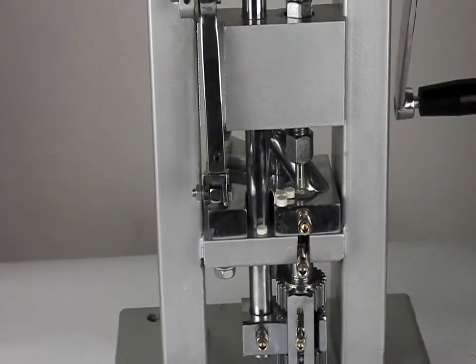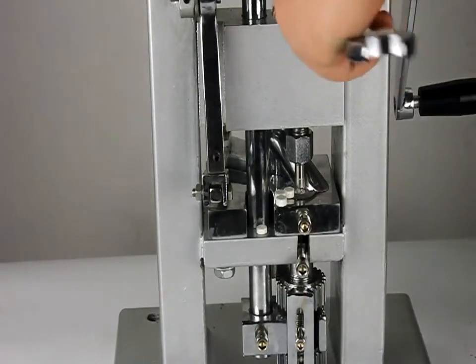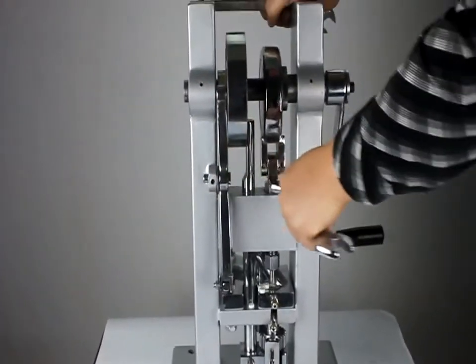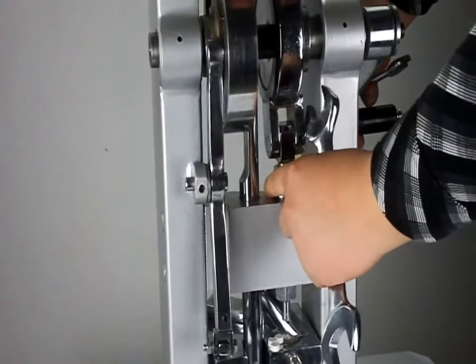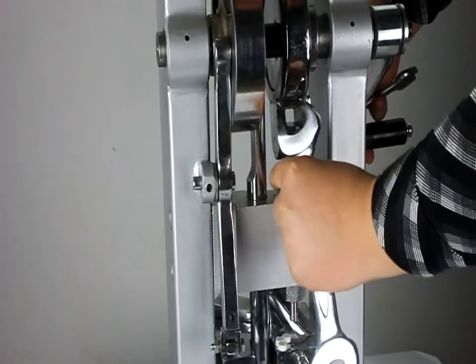So now we teach you how to adjust the hardness of the tablets and the thickness of the tablets. As you can see on the top, this place you can adjust the hardness for the tablets.